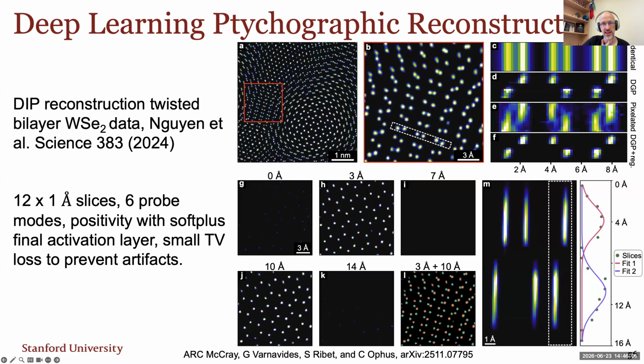And so in the lower right, now, what we're showing is plotting along the beam direction. And that Gaussian fit is about 1 nanometer or 10 angstroms, showing that we're able to hit the theoretical maximum spatial resolution along the beam direction.